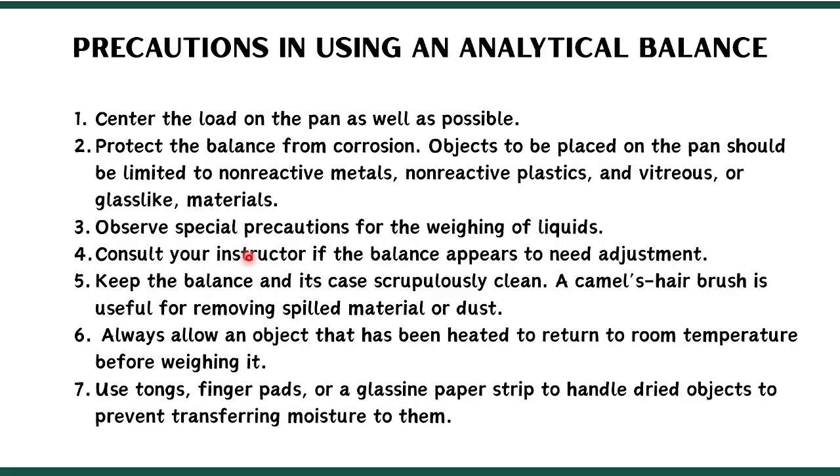Then we also need to consult your instructor, or someone who is expert in calibrating the analytical balance, if there is a need for adjustments. Fifth, we also need to keep the analytical balance and its case scrupulously clean. So, dapat limpyo gyud siya.